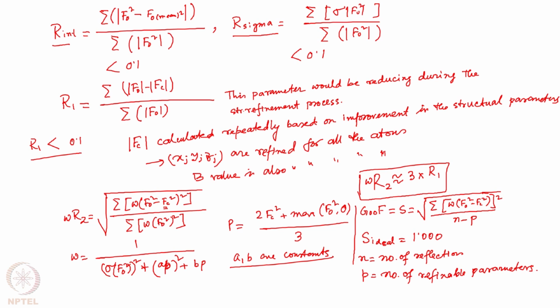When I am saying refining again and again, it is linear least squares refinement. The linear least squares refinement method is used for the structural refinement. During this process, it modifies or alters the atom coordinates to fit the electron density appropriately and to also keep the bond lengths and bond angles appropriate as per the chemical bond connectivity. So this refinement process leads slowly towards the complete structure.